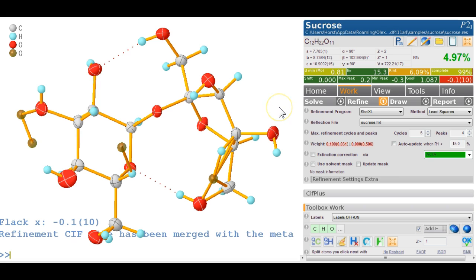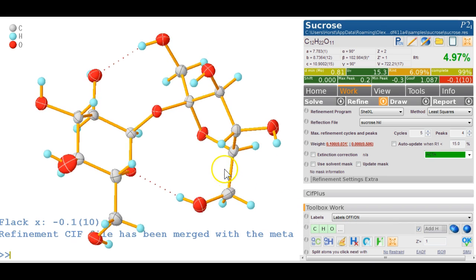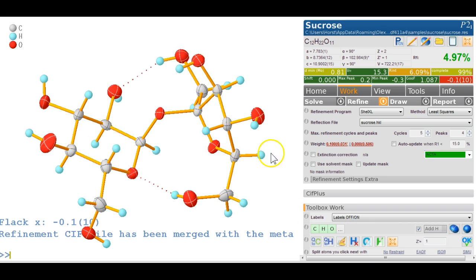shows us those Q peaks with bonds, and another Ctrl Q, and then all the Q peaks are hidden. It's the same as pressing the Q button here. It shows the peaks without bonds, with potential bonding distances, and it hides them. And that's it. We've got the structure.